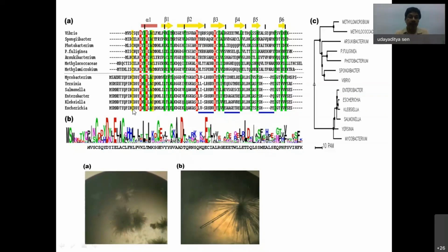So what we did, we modified the cysteine with iodoacetamide. If you reduce your protein, make all cysteines SH, then add iodoacetamide, it will form a covalent bond with the cysteine sulfur. So they can never form a dimer with other molecules. After applying this and applying glycerol, I could improve from this stage to this stage, and surprisingly, this crystal diffracted up to 1.7 angstrom, and we solved the structure. So this is an example for chemical modification.